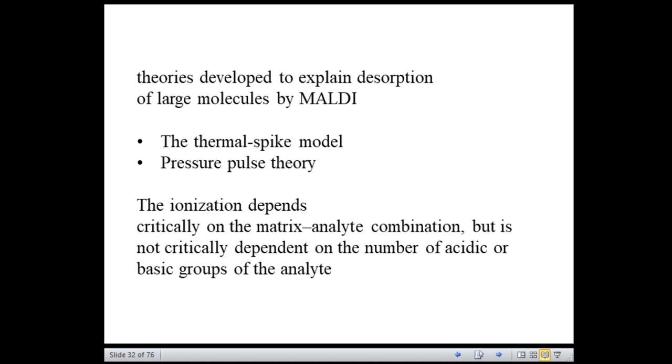Number 1, the thermal spike model. Number 2, the pressure pulse theory. These are the most widely accepted theories which explain desorption of large molecules by MALDI.